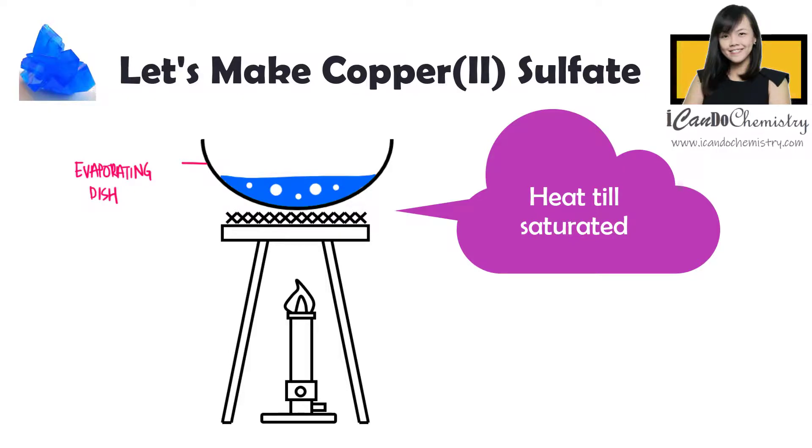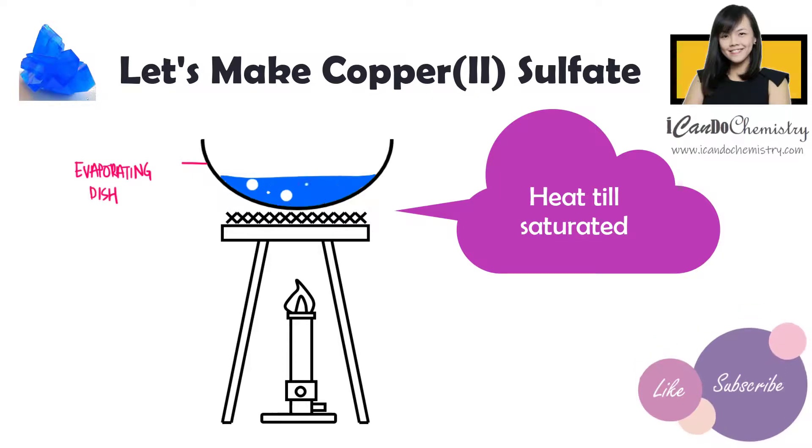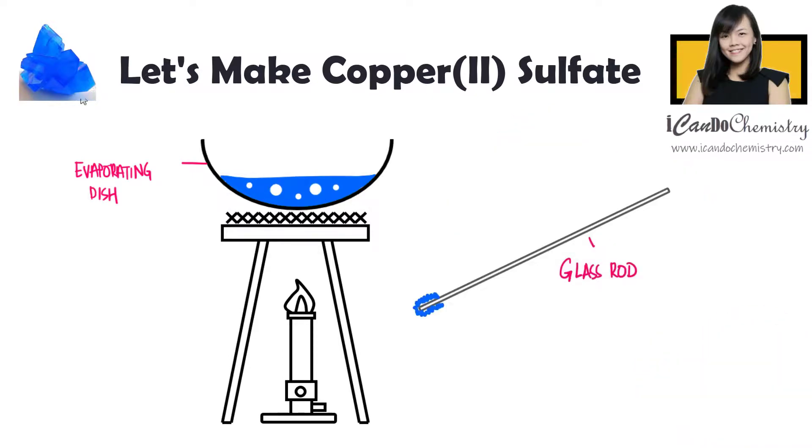To test whether a solution is saturated, we will dip a clean glass rod in the solution. As the solution cools, a saturated solution should leave small crystals on the rod. If not, we will need to continue heating until it is saturated.